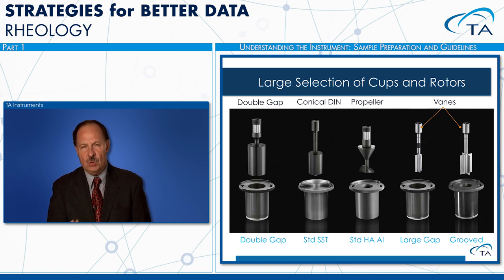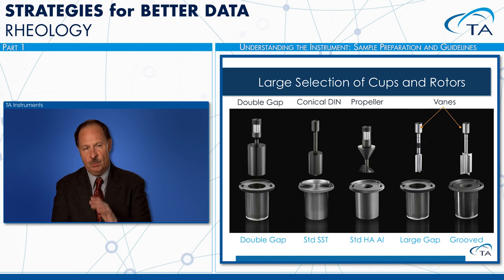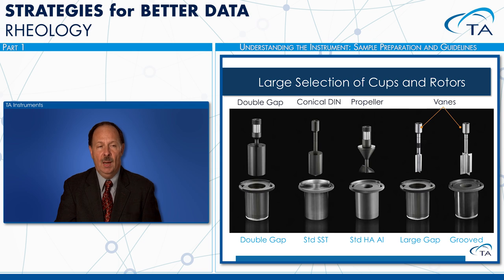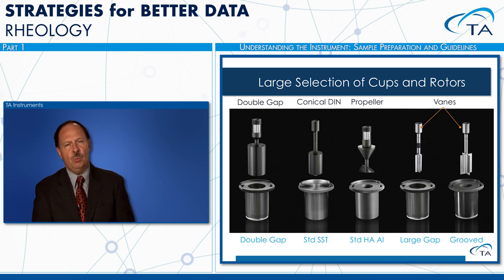And the way to keep the material stirred up in this mixture is to use this impeller, which you can see from the design is well designed to get good mixing of our materials. There have been some people that have used this for other materials besides starch, just because it provides very good mixing. We also have a helical rotor that some people use on some structured materials to get the viscoelastic properties of these materials.